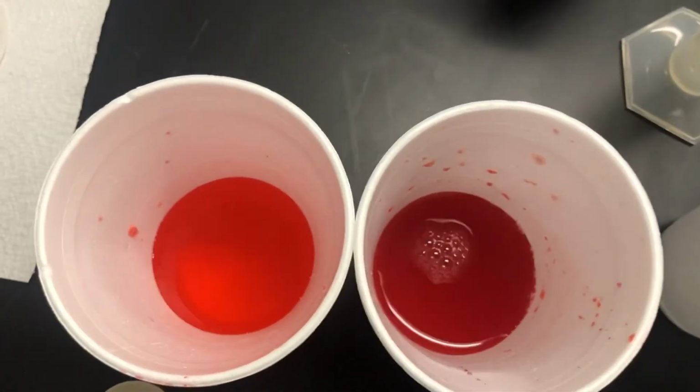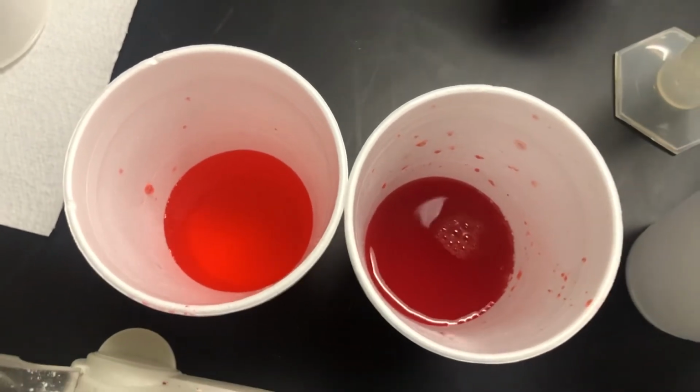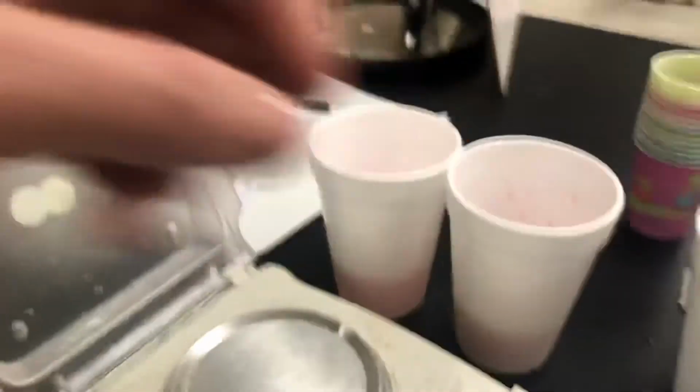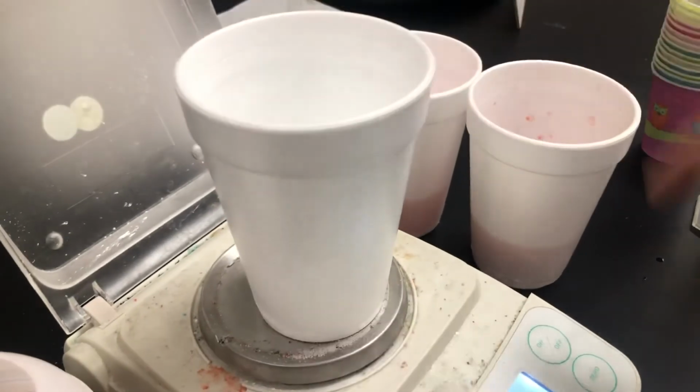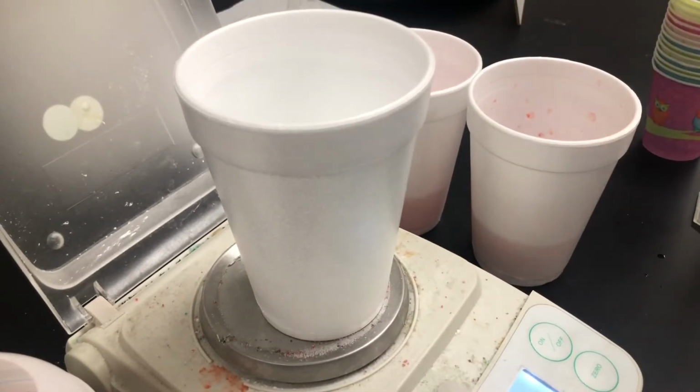Now let me put them side by side so you can see. You can definitely tell there's a difference there, right? That's my whole bottle. Then we're going to do a third one. Here it goes. Zero out my cup.